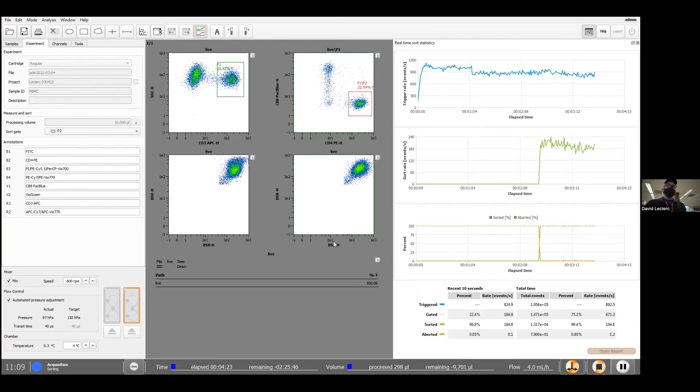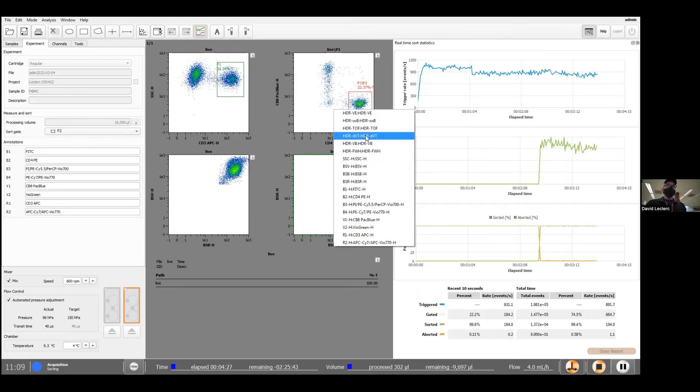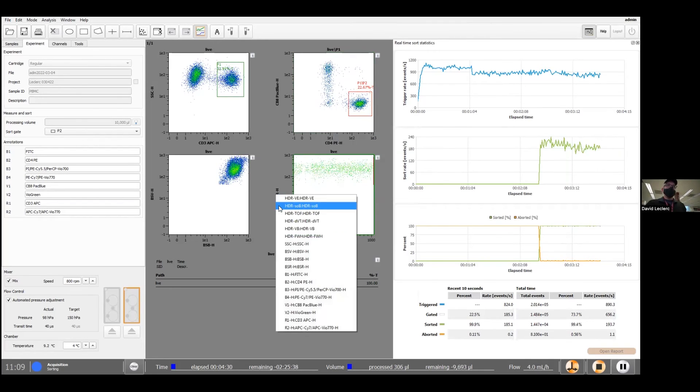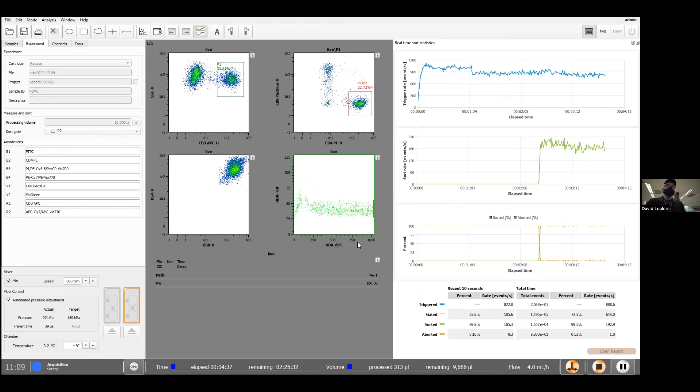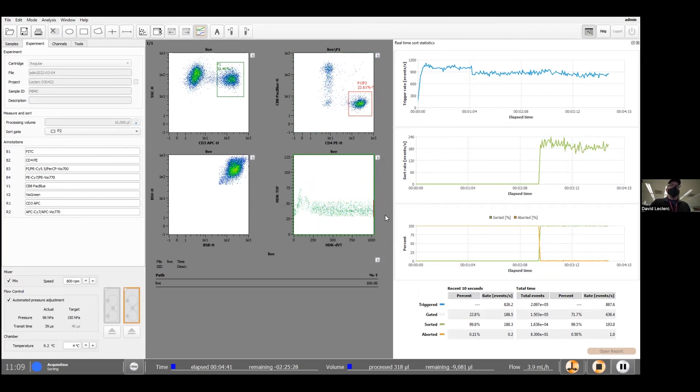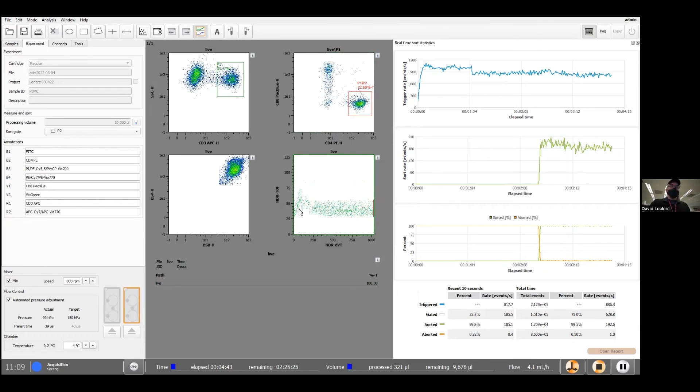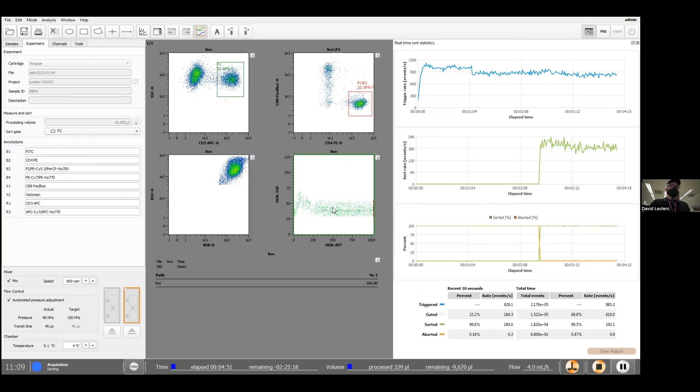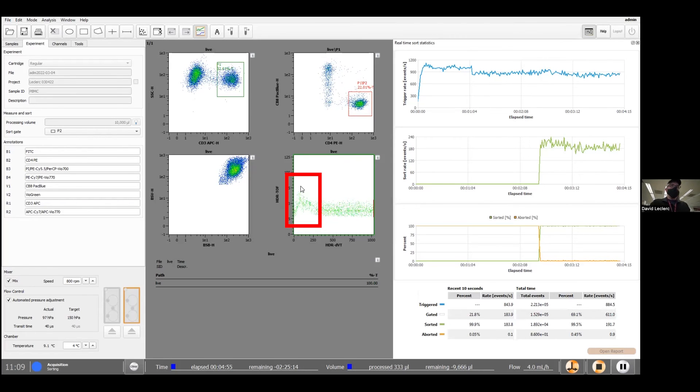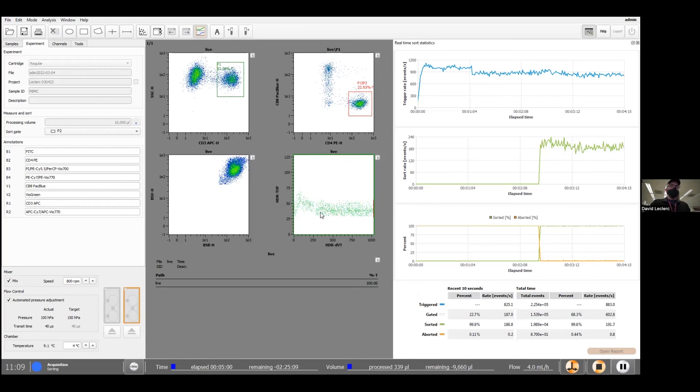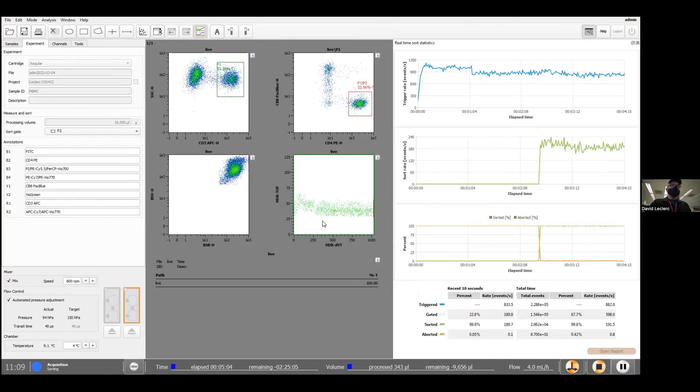One graph that I like to use is this axis over here, HDR-DVT against the time of flight. And this is a sanity saving graph. So essentially we're measuring the time of flight of the cell between two lasers in the cartridge. It should be around 40 microseconds. We see a disturbance over here in the speed. And that is essentially caused by the movement of the valve whenever we sort cells. And so this is actually an indication that your cartridge is working properly.